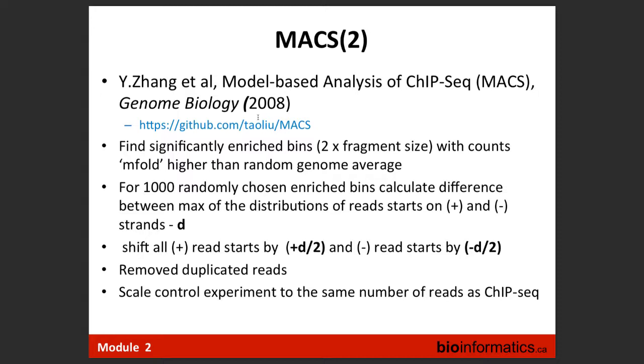People introduced more parameters. So that's maybe why we have more than 50 tools published, but they don't last that much because they were tuned. The heuristic, so all of this is heuristic, including MACS, was not really sustainable for the next data set. So MACS assumes Poisson. How does MACS derive the single Poisson parameter lambda? There are several modes.